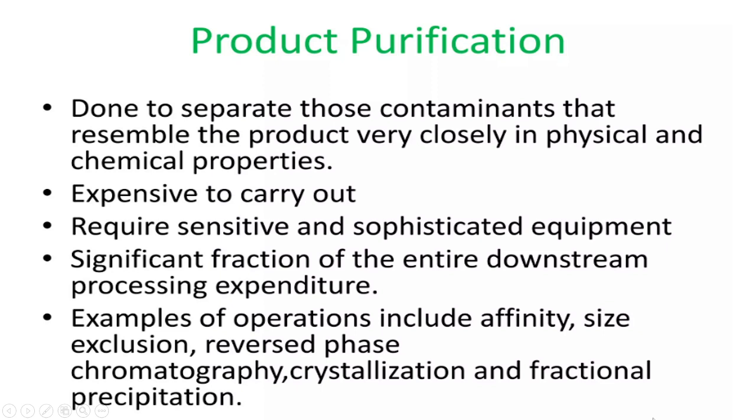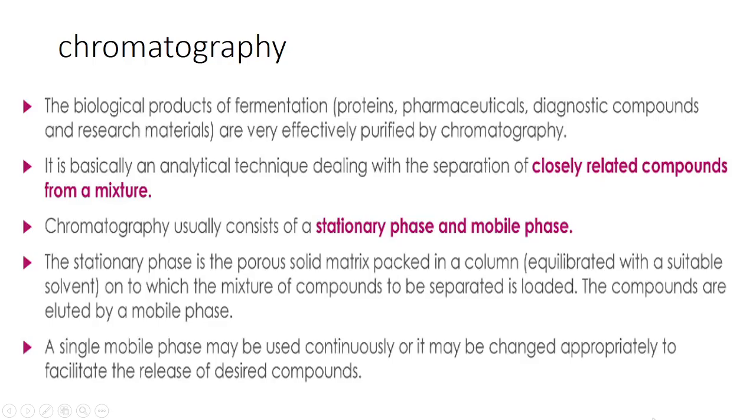By affinity, size exclusion, reverse phase chromatography. Different techniques of chromatography are routinely used. Crystallization and fractional precipitation are also used. The most dependent one is chromatography. The biological products of fermentation are effectively purified by chromatography, so very closely related compounds can be separated from a mixture.